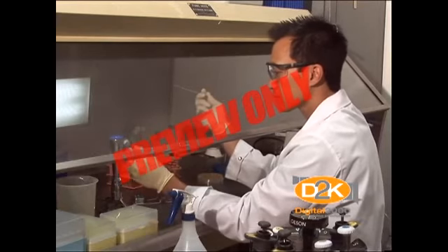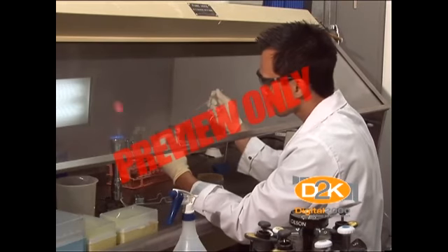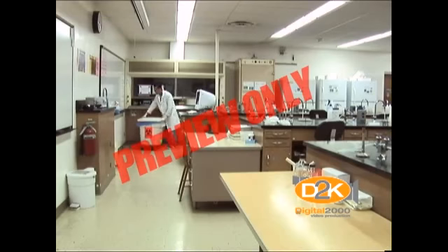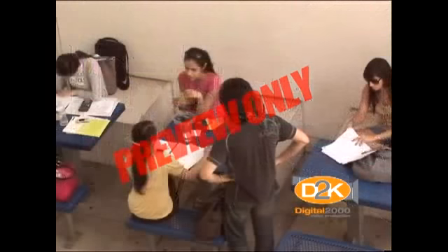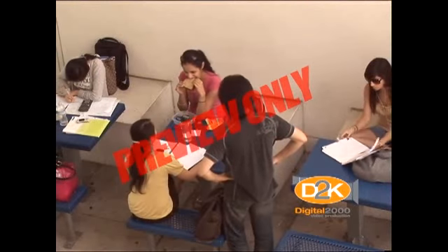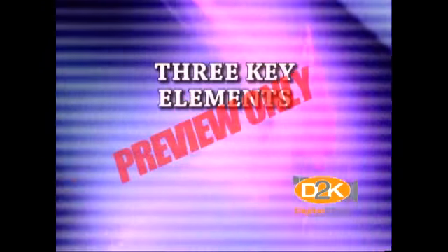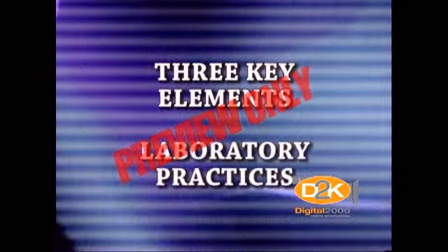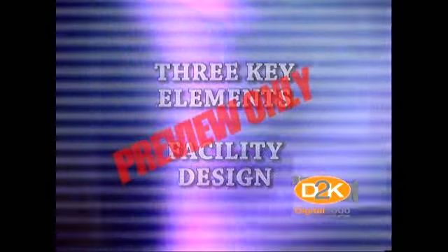Secondary containment protects the environment external to the laboratory from exposure to infectious materials. Good facility design and operational practices can provide work areas that are separate from public areas or easily accessed laboratory areas. The 3 key elements of biological containment are laboratory practices, safety equipment, and facility design.